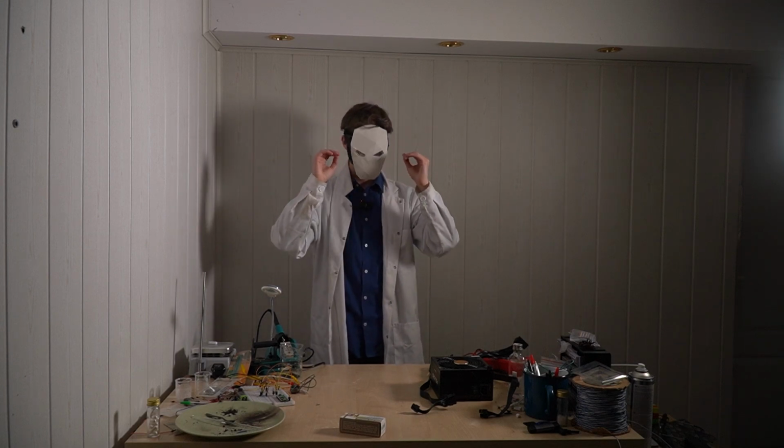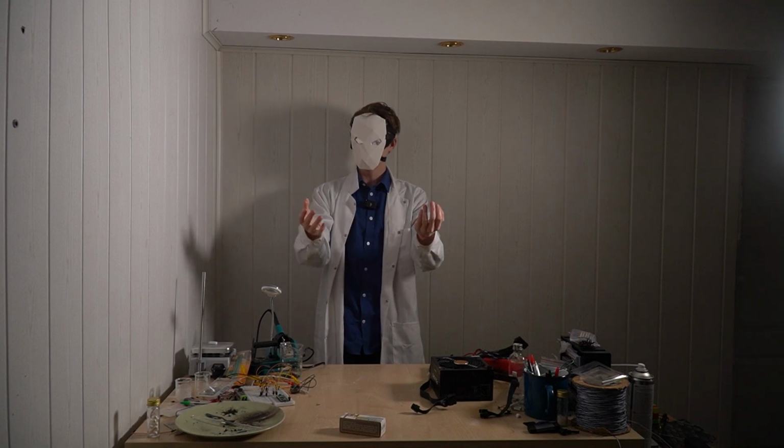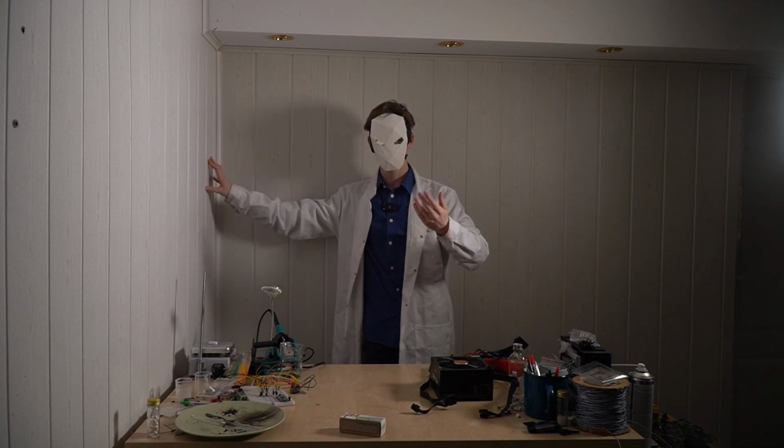And even if something isn't corrosive, even if something shouldn't be dangerous, it's still better to wear the lab coat and the safety gloves, because you don't know. So when you're doing chemistry or physics or science in general, just remember, you don't know everything. That's kind of the point. That's kind of why you do science. And so you're not going to be aware of every single danger that's out there. Because of that, you should just play it safe, just in case.